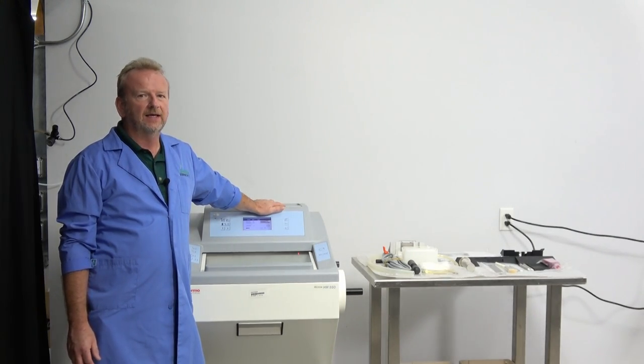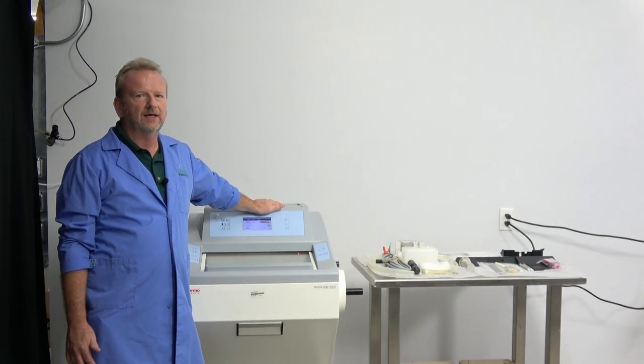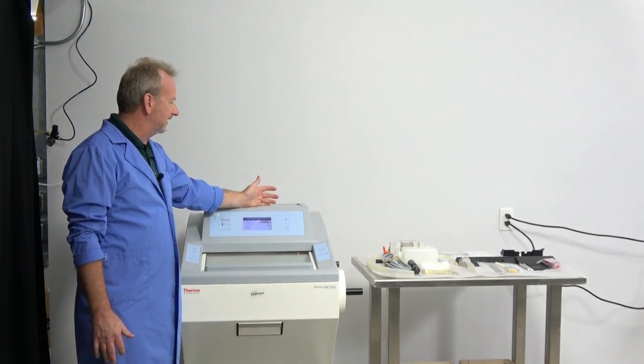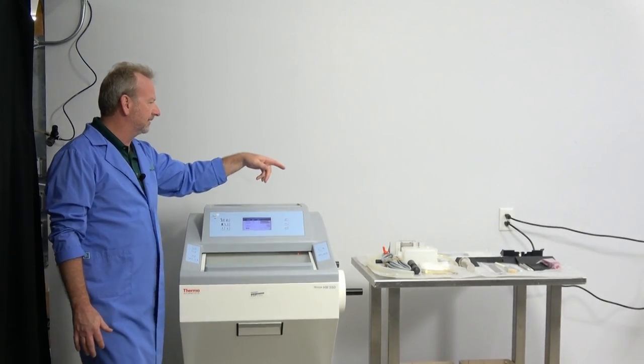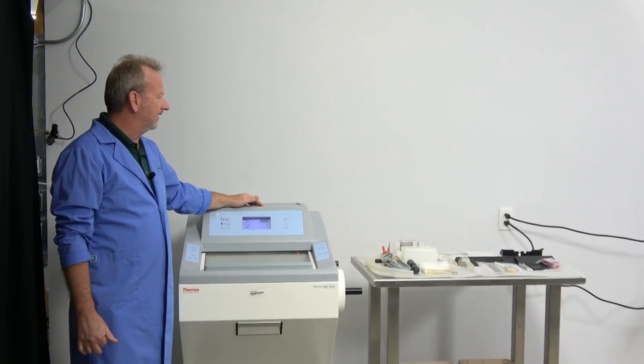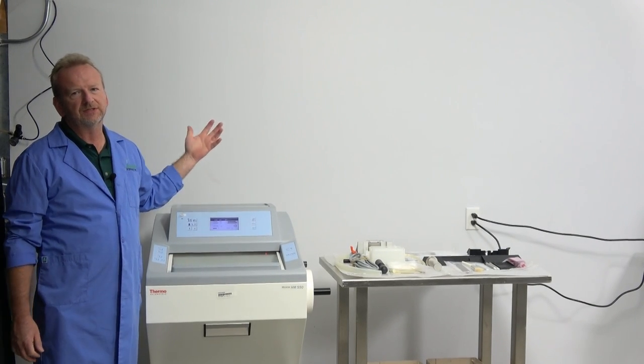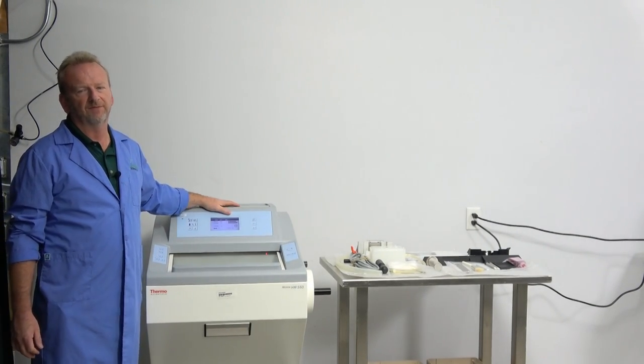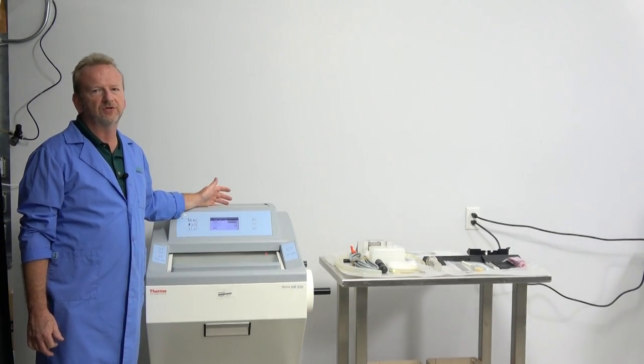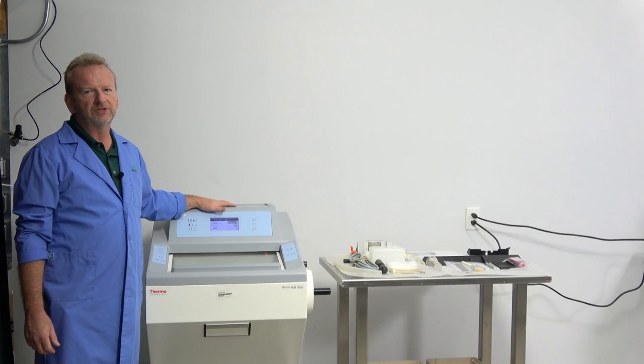And I just wanted to show you a few things that it did come with. Because over here on the table, all we did was just unwrap it from the bubble wrap that it was in. The original packaging, we have the original crate for this one.